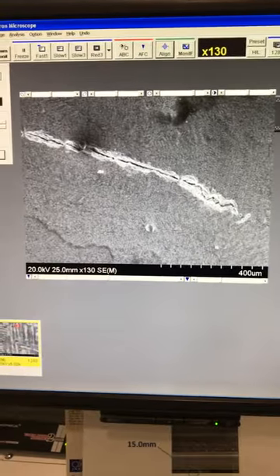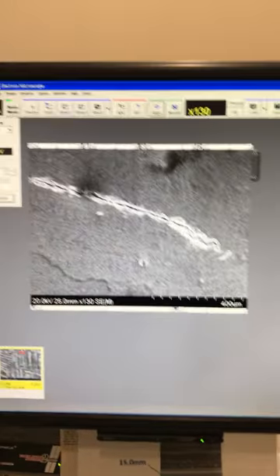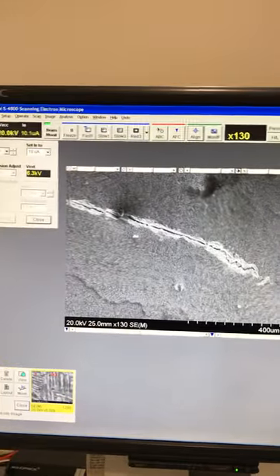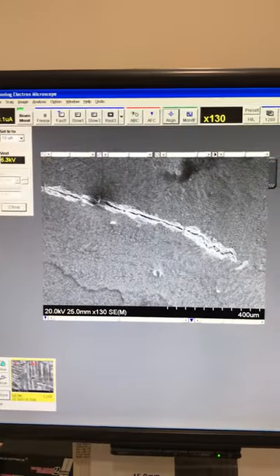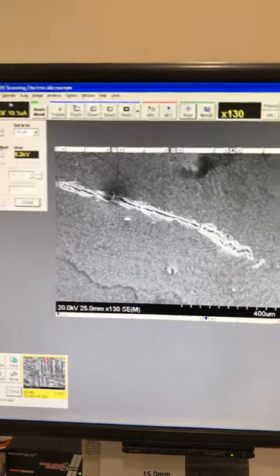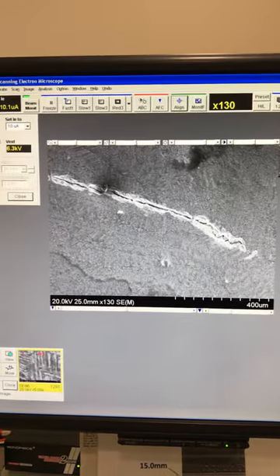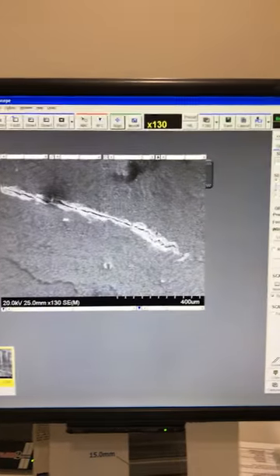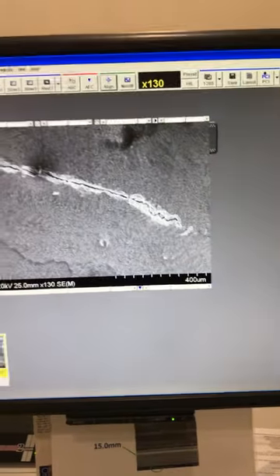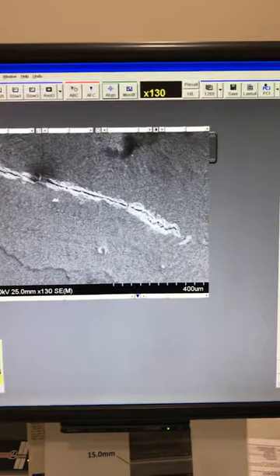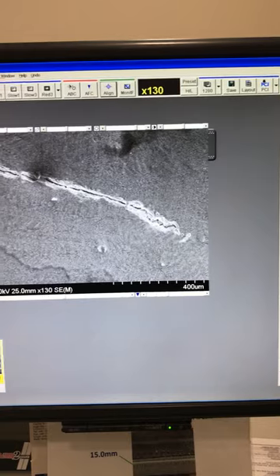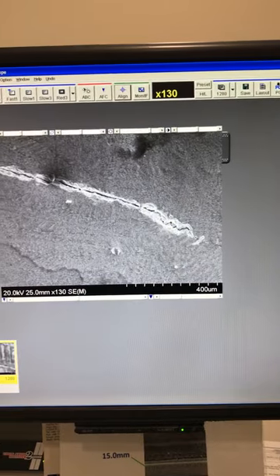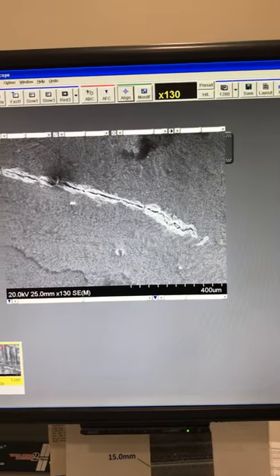I'm going to talk about detectors available on this microscope. We have two different detectors available, two secondary and one backscatter. I will start with the secondary electrons to show you the difference.